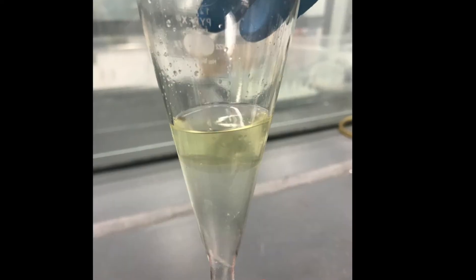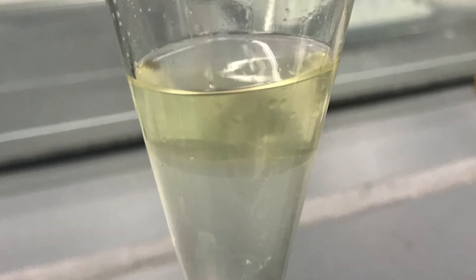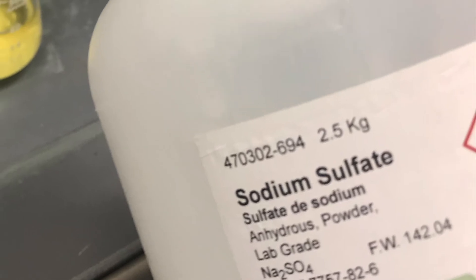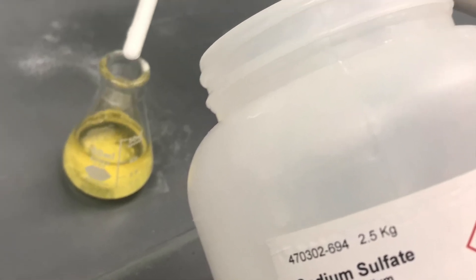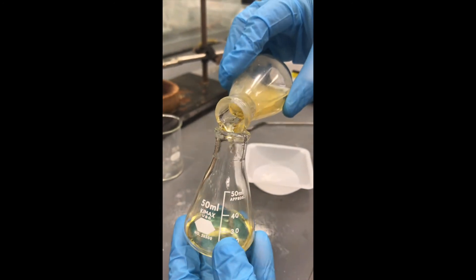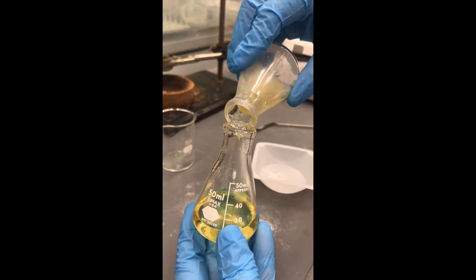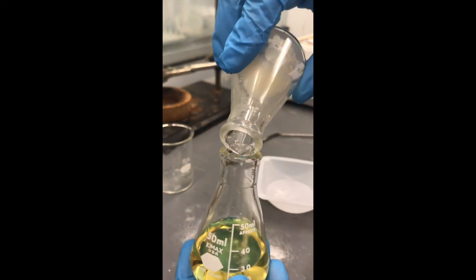I am going to wash that aqueous layer one more time with another 5 milliliters of ether, and then I am going to take both ether layers, put them together, and dry with sodium sulfate. After a few minutes, when my ether layer is dry, I can then decant or pour my ether from the sodium sulfate into a new Erlenmeyer flask.